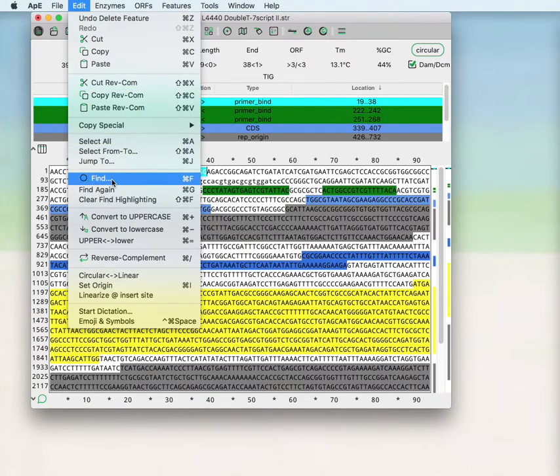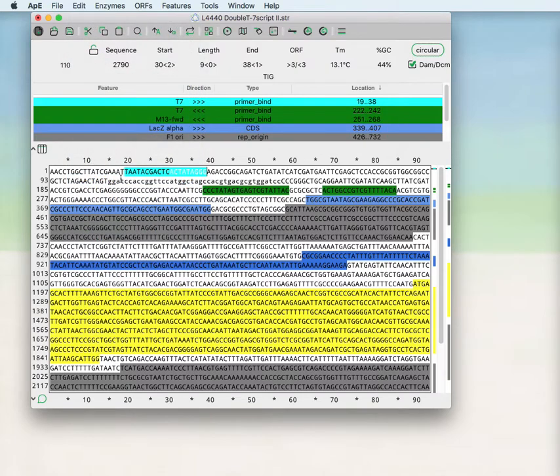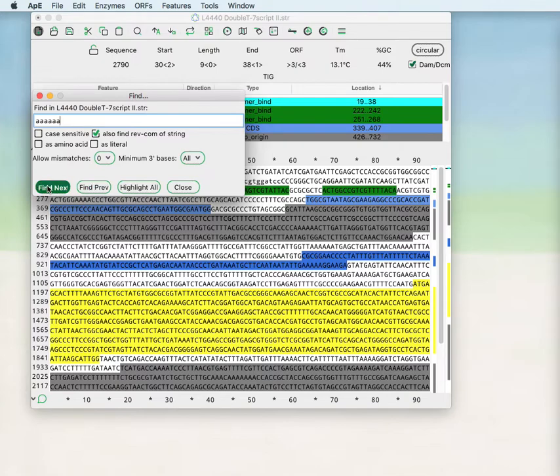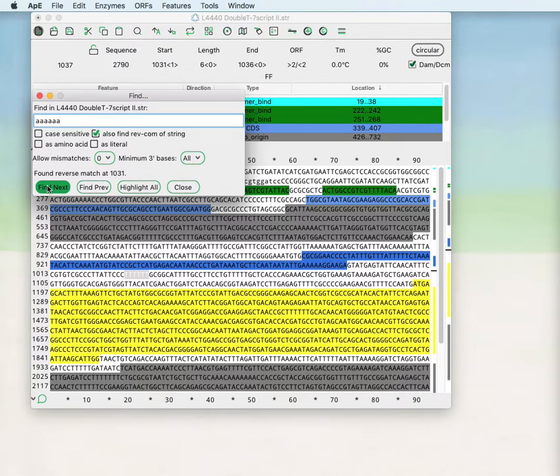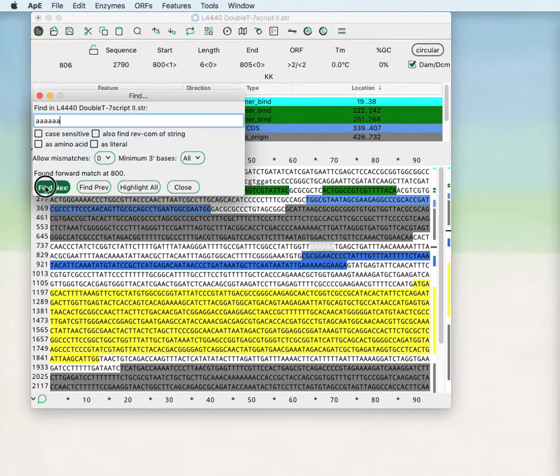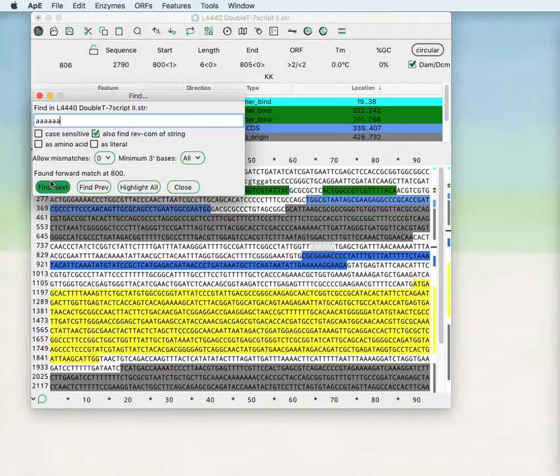There's also a find function where you can find DNA sequences and just do find next and it will move the selection to that region. You can choose to find that in both the top and the bottom strand or only in the top strand, in which case it will not find the sequence in the reverse complement.